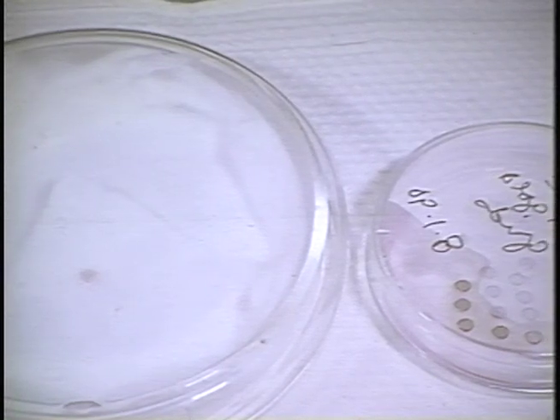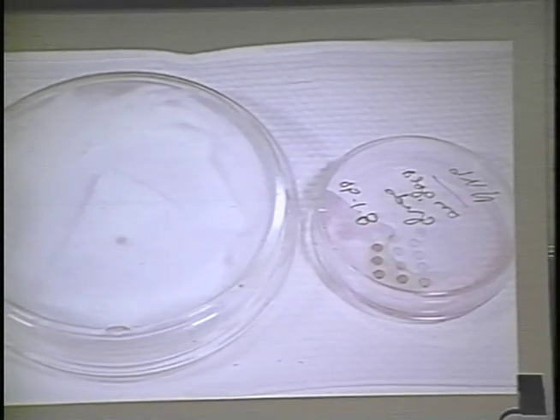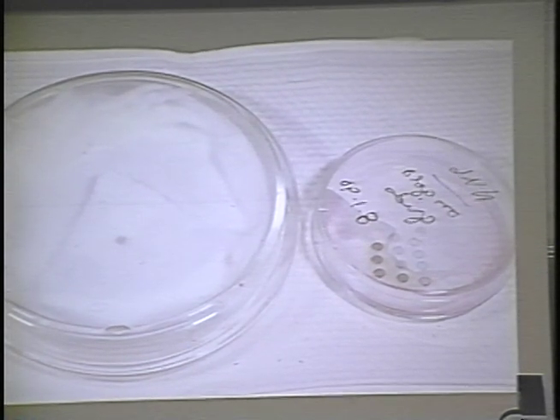Immediately before freezing, the grid is removed from the culture medium and blotted in a humidity chamber to remove the majority of the fluid on the grid. This blotting procedure was critical to obtain a thin enough sample to ensure both optimum cryofixation and imaging in the cold stage. After blotting, the grid is then immediately transferred to a freezing apparatus, shown on the next slide.